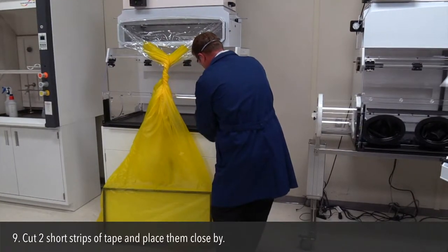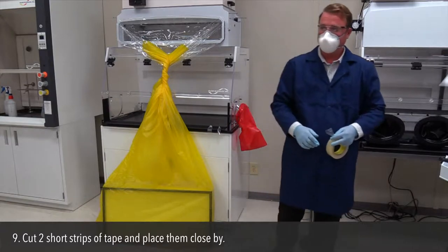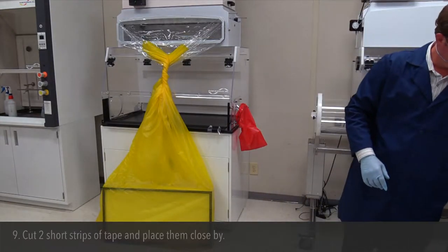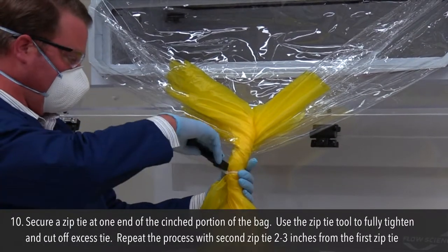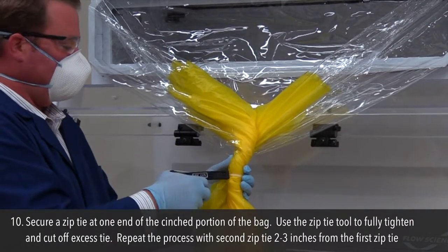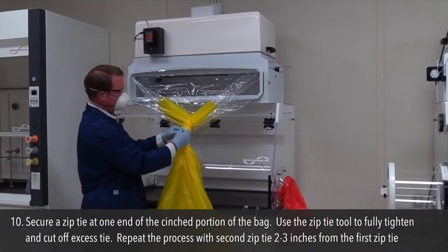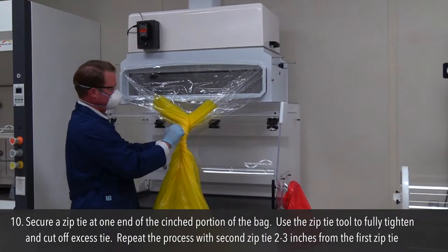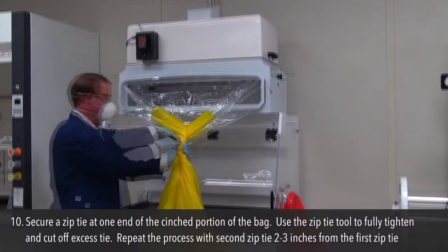Step 9: Cut two short strips of tape and place them close by. Step 10: Secure a zip tie at one end of the cinched portion of the bag. Use the zip tie tool to fully tighten and cut off the excess tie. Repeat the process with a second zip tie 2 to 3 inches from the first zip tie.